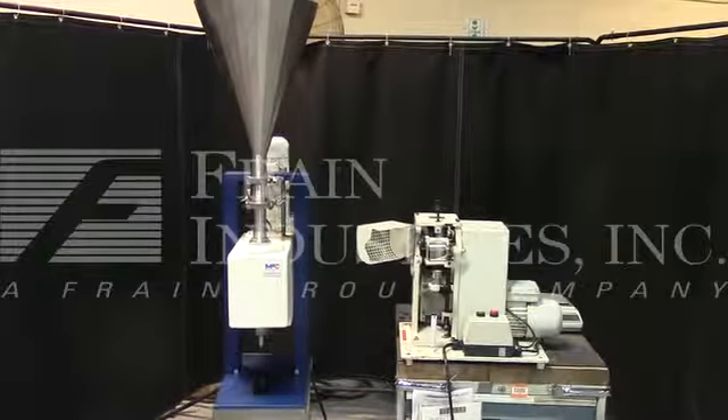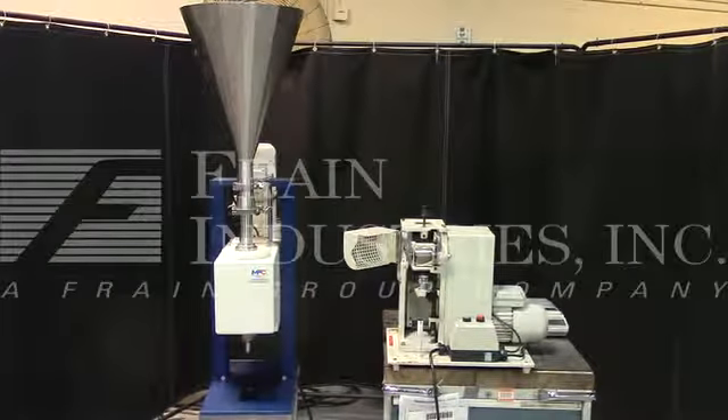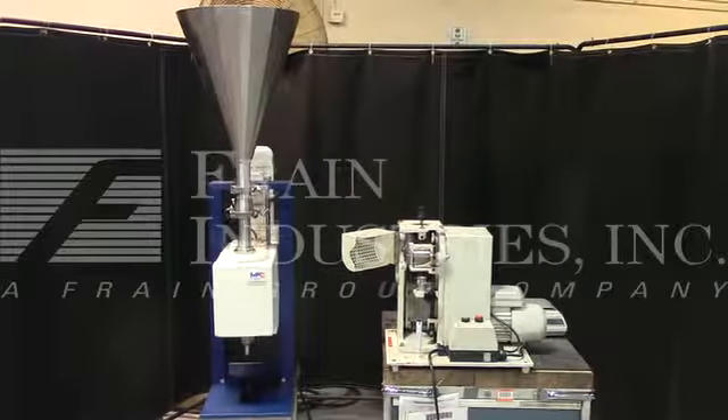Hi, we're the Frame Group Service Technicians for the semi-automatic tube filler and crimper. Before powering up the machine, it's recommended to read the manual in its entirety. The manual will be placed with the machine when it's shipped.